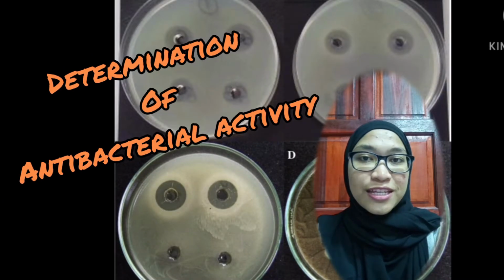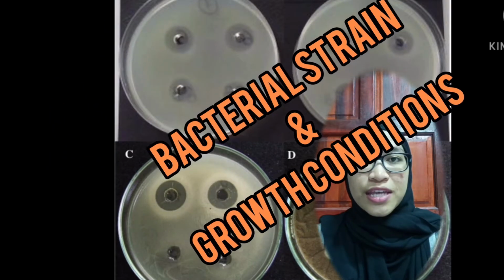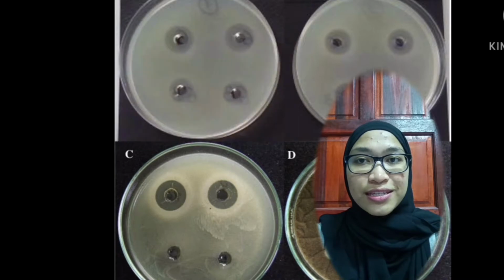The next method is to determine antibacterial activity. The first experiment is bacterial strains and growth conditions. 10 bacterial strains were used for the antibacterial studies.